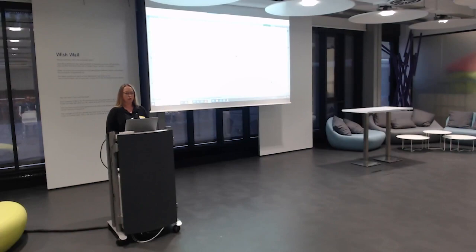So let's go and do so by clicking on this magnifying glass. It goes to the material library. In this case, I search on CHO, show me all that is available for CHO. I'm going to select this and bring it into my experiment. Or the other way around, if I have it in Signals inventory, I can look for containers. Show me all containers that contain the CHO cell line in the inventory. There are 10 right now, and I can go ahead and say I want Ben's run.